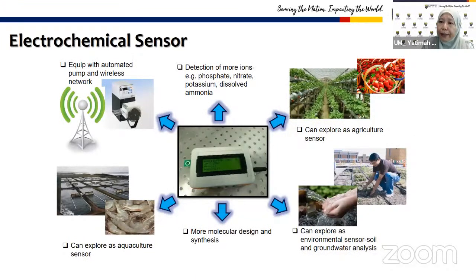over maybe 10 years in Universiti Malaya, where we've got quite a big number of grants from the Ministry of Higher Education. It's a prototype grant where we produce our own electrochemical sensors that can be applied to the field, okay, to real scenarios. For example, we have developed a small kit with a USB detector, where we can convert the algorithm and get the reading straight away from the reader. So the examples that I can show you later are nitrate and phosphate, for example, because they can be used for agriculture applications.